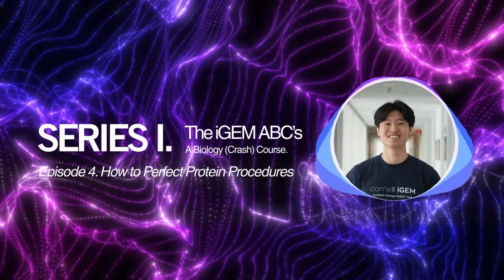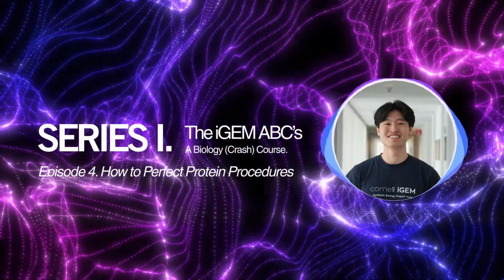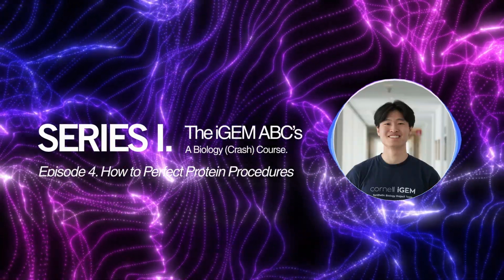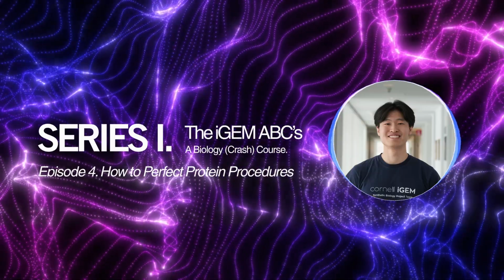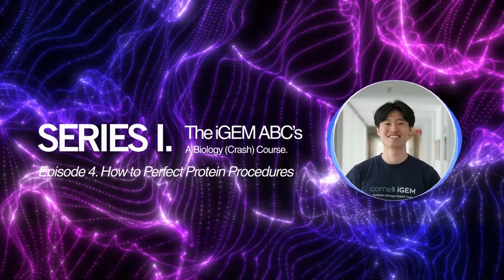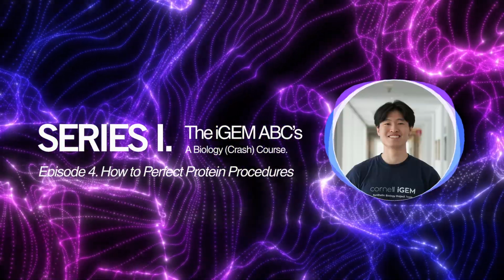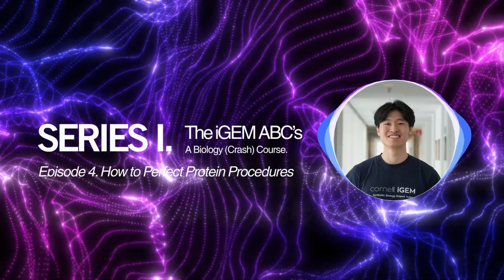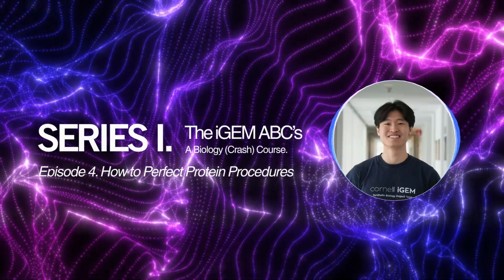Basically, all enzymes are able to catalyze or help chemical reactions that occur in the body or in the cell. For example, going back to the 2024 iGEM case, we worked with perchlorate reductase. So that's an example of an assay, right? We have the perchlorate reductase enzyme in a system. We add the compound that the enzyme affects, in this case perchlorates. With the two, we're then able to measure the degradation of perchlorates, which is a direct measure of how well the enzyme is working. And we're able to quantify the activity of perchlorate reductase.